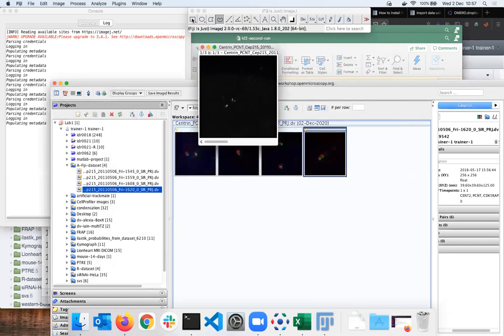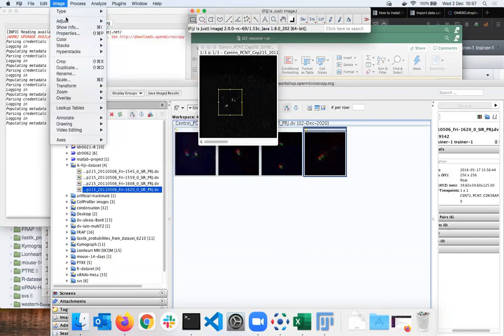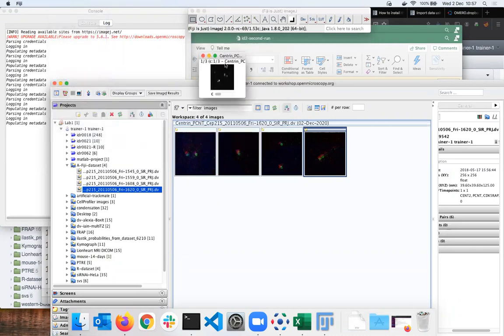And if I've done so, I can draw a rectangle on that image. And because this workflow is intending to demonstrate the capability of creating a new image, I am not now putting the ROI into ROI manager. Instead, I go image crop. This is probably the easiest workflow which produces a new image for me.